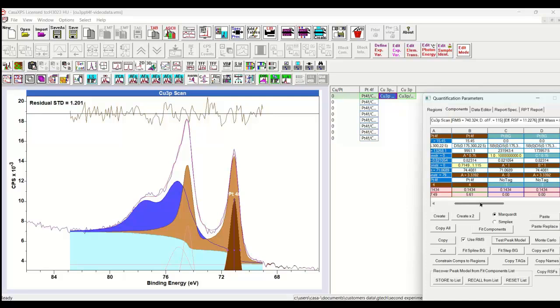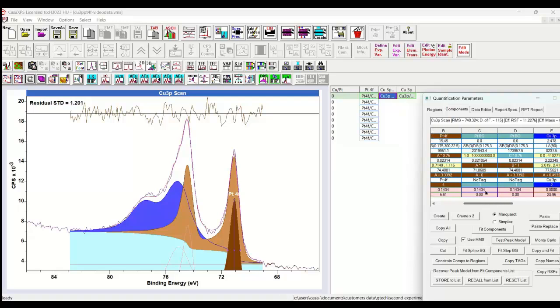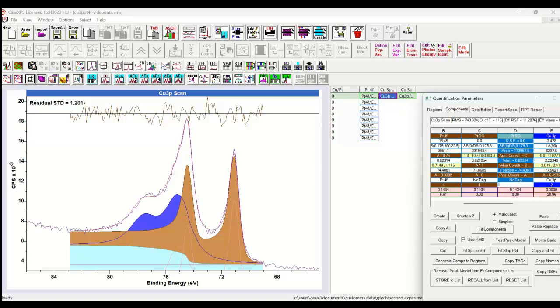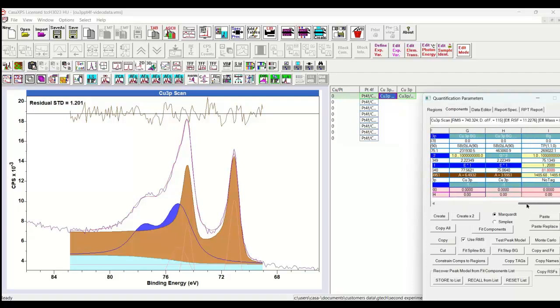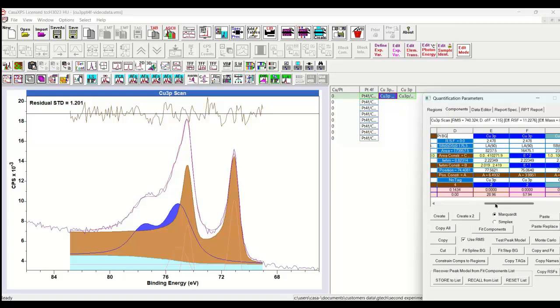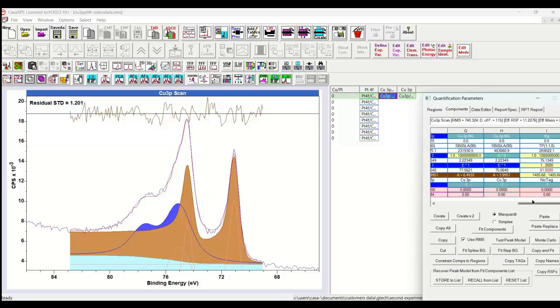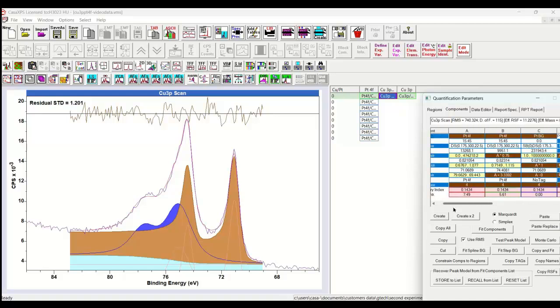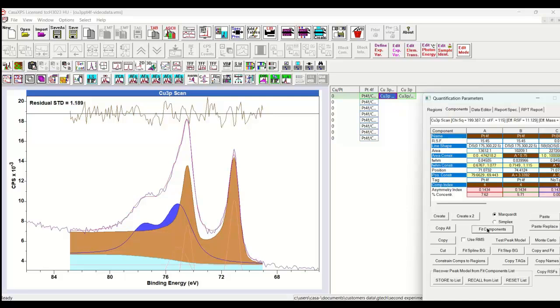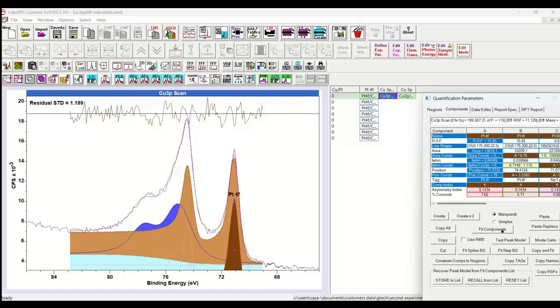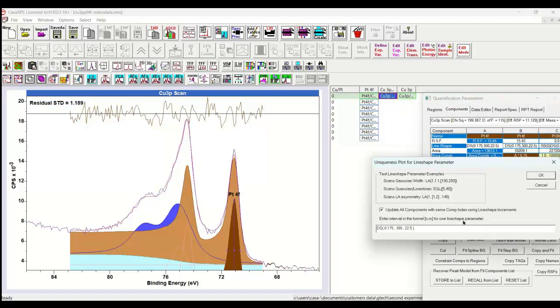So that's just automatically performed, provided I have the same component index for all of these Doniach-Sunjic line shapes. All the others have a different component index. As you can see, copper has two, and all the other background types have minus one. So only the Doniach-Sunjic line shapes and the backgrounds of the Doniach-Sunjic line shapes are included in this calculation because they have the common component index. So let me just adjust the peak model based on using the chi-square rather than a root-mean square. And then I select the line shape field. I don't have to do anything other than select it before I press the test peak model button. And then up comes the dialog window. It's got the tick box already ticked that says update all the components with the same component index using the line shape increments.